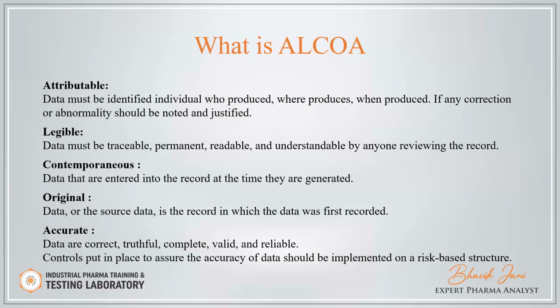It's attributable. Legible: data must be traceable, permanent, readable, and understandable by anyone reviewing the record. Understandable means whatever document you prepared, the language should be understandable by all the persons working in your organization.